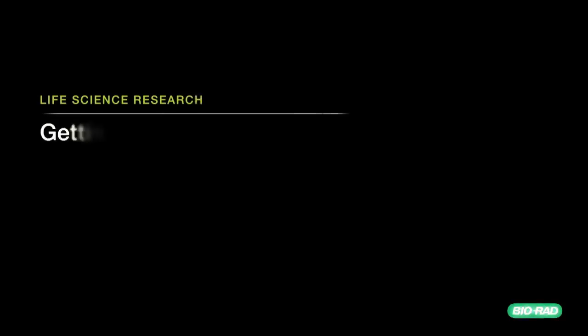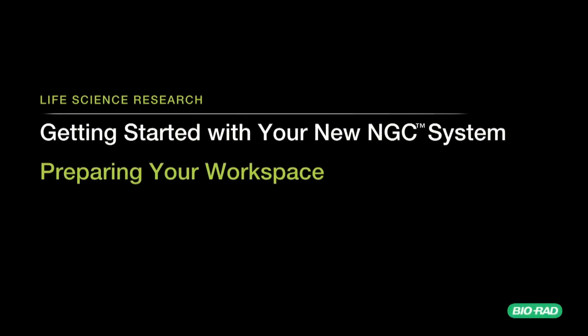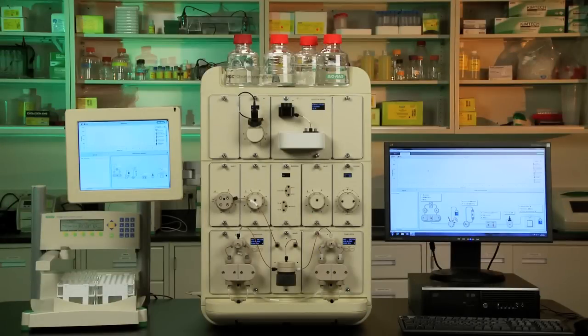This video describes the site requirements for your Bio-Rad NGC chromatography system. Before setting up your system, ensure the bench space can support the weight and size requirements.